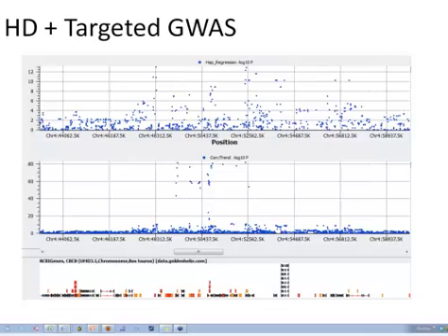And from my talks with him, what I believe is that if you have a newer disease, where the causative mutation appeared relatively recently, I think you could get some good results with the 50K chip. If you're dealing with an older mutation, at least 100 years old, I think the high density chip gives you better resolution. The 50K chip, as I showed in the slides up here, it'll work. It does show you the right region. It gets you close.